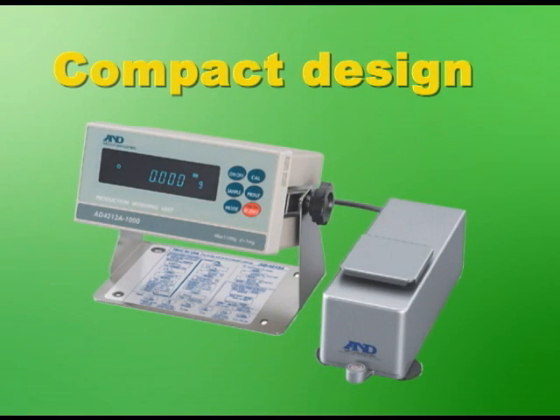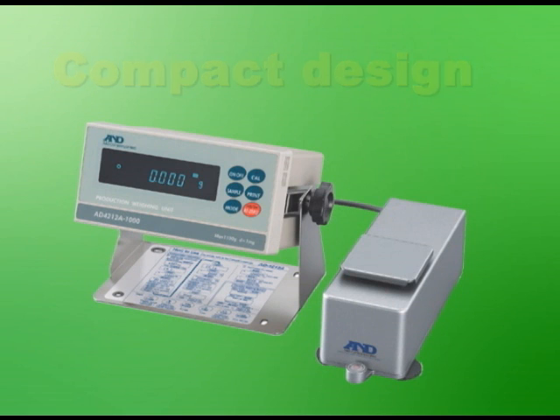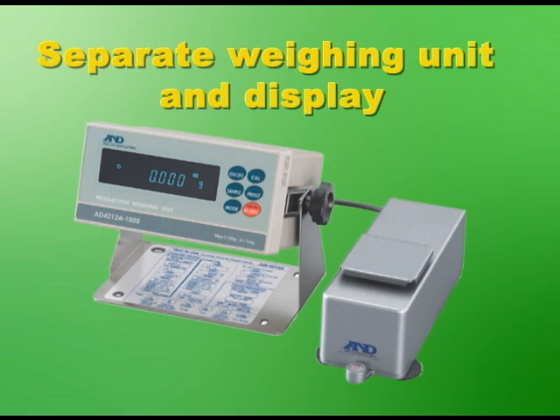The compact design as well as the separate weighing unit and display unit ensures easy installation of the AD4212A at any stage of your weighing system.